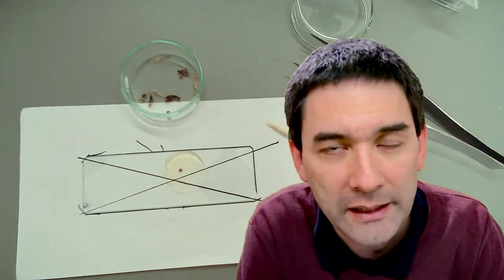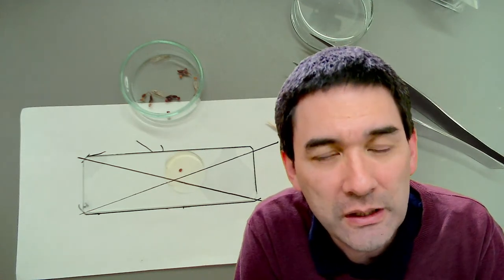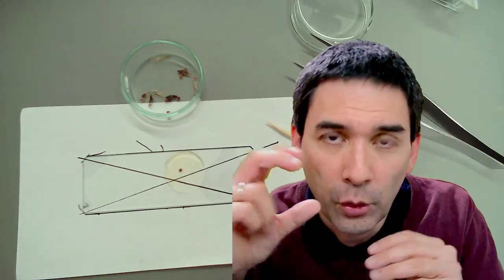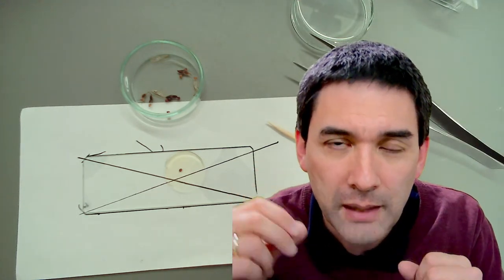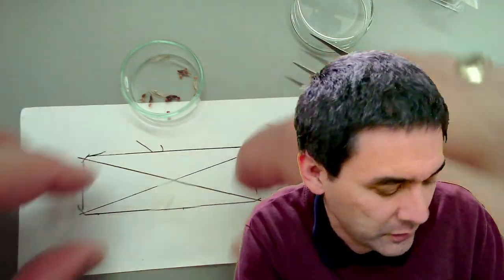I'm still going to look at it because it's such a large specimen that essentially it doesn't really matter. Because I'm going to be using a low power magnification, and therefore it doesn't matter. I don't need high power, and therefore it's not a problem.